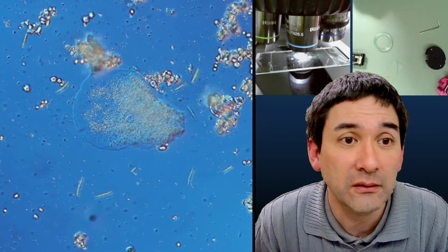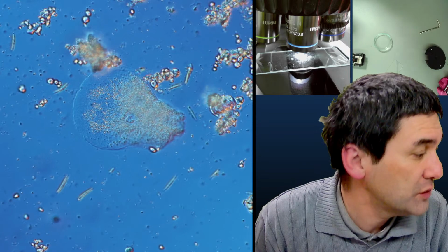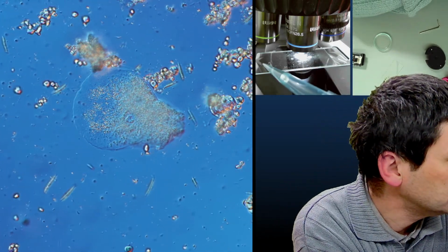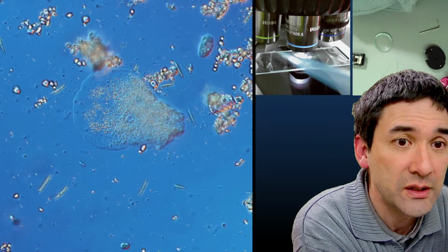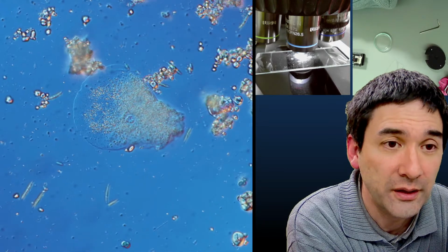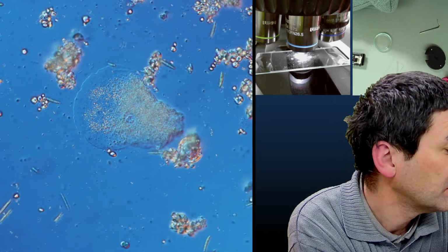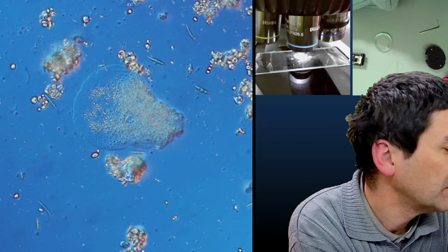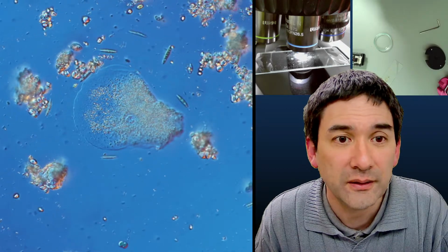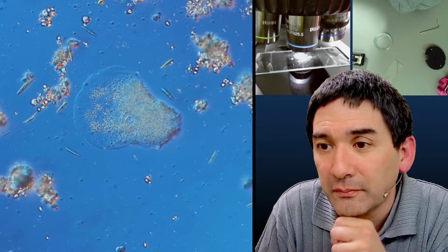Yeah, so the cell does not seem to become much thicker. Yeah, so that's kind of interesting. There's still a little bit of water there, so I'm going to add a little bit more. Let's see if this. Here the flow starts again. See how the other cells are all carried away. So let's see if this. So let's move on again a little bit.